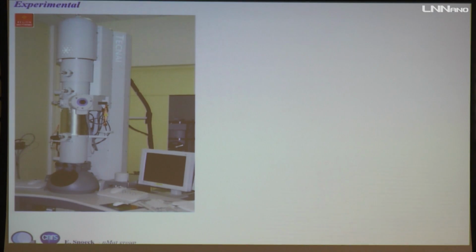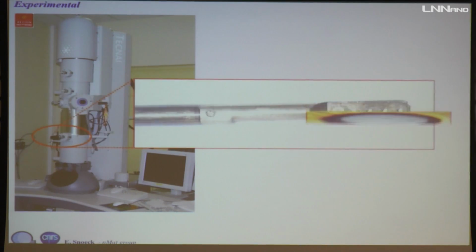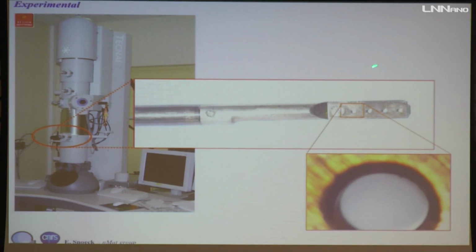So how does it work? This is a microscope, an FEI Tecnai microscope. We are doing holography on this microscope, and in the image plane there, where we put the selected area aperture, actually you add on the system a support with one little wire, which can barely be seen there, you see, and you are polarizing this wire with a voltage up to 100, 200 volts, and then the parts of the beam which pass above it and below it will be bent and then overlap to create the hologram.